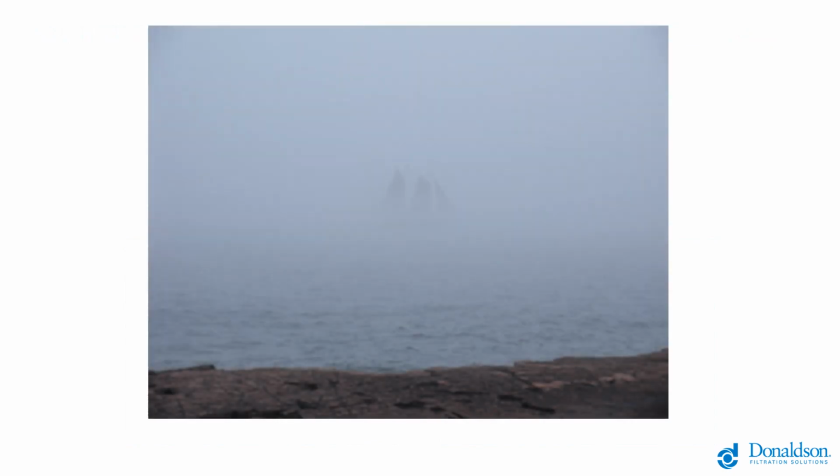So again, just keep in mind that you're looking for hard particles, similar to the ship in the distance here, and you're having difficulty getting an accurate number of how many ships are there because there is this suspension of these small particles floating around in the oil, and you're having a hard time seeing the hard particles. They are what does the damage, and they are what you want to assess accurately in your oil analysis.